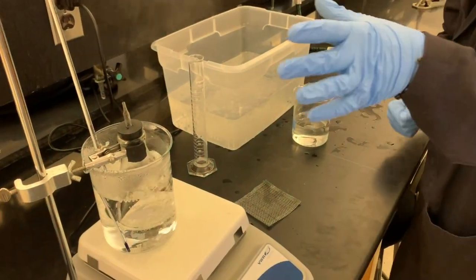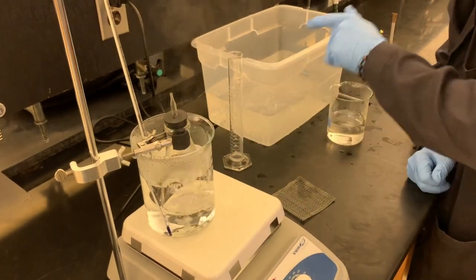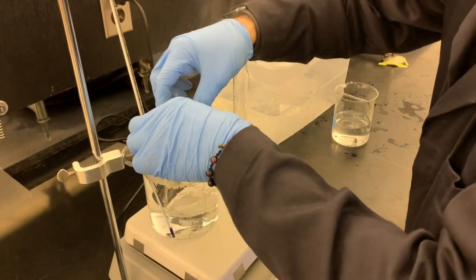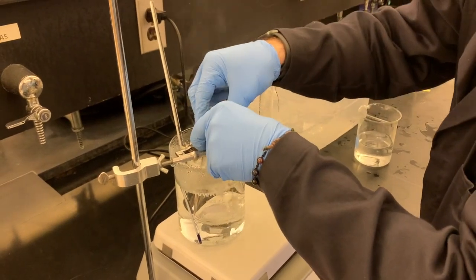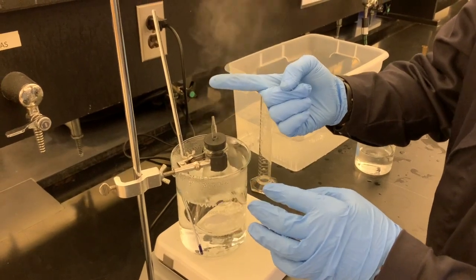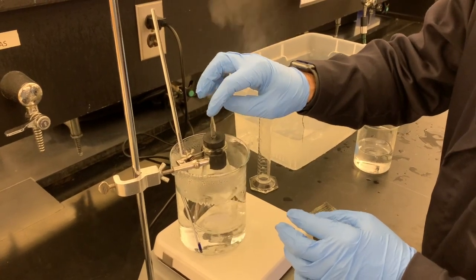So at this point, we're going to take the flask as before and move it into the ice bath, taking care to keep the stopper in good contact with the flask. You want to make sure it's nice and tight so you don't have any leaks. And also, until you actually have it underwater, you want to make sure that your finger's on top of the little point of the end of the pipette here.